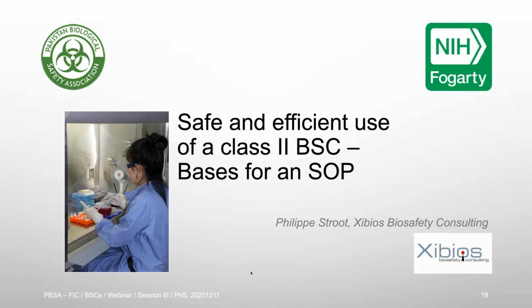If you look on the internet, you will find a number of SOPs for using biosafety cabinets, mainly from American universities. I don't think it's a good idea to copy and paste such SOPs. The SOP has to be very precise and specific and really adapted to your activities and also to your biosafety cabinet. You can certainly be inspired and use them as a basis, but please don't copy and paste them; adapt them really to your activities.